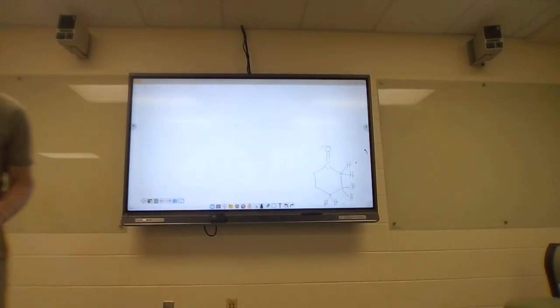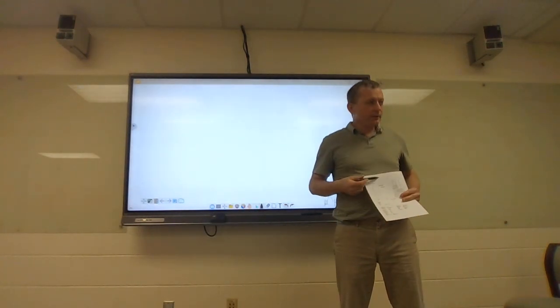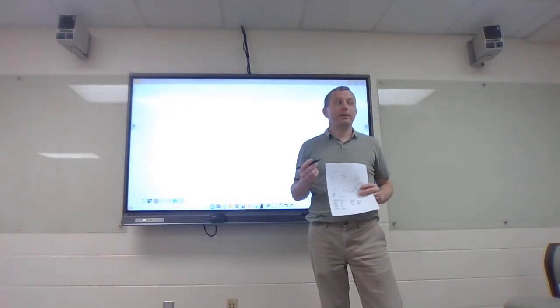Any of you see an OH? No? Now there's some things. Anyway, when I see this, weak carbon-hydrogen bonds, aromatic.